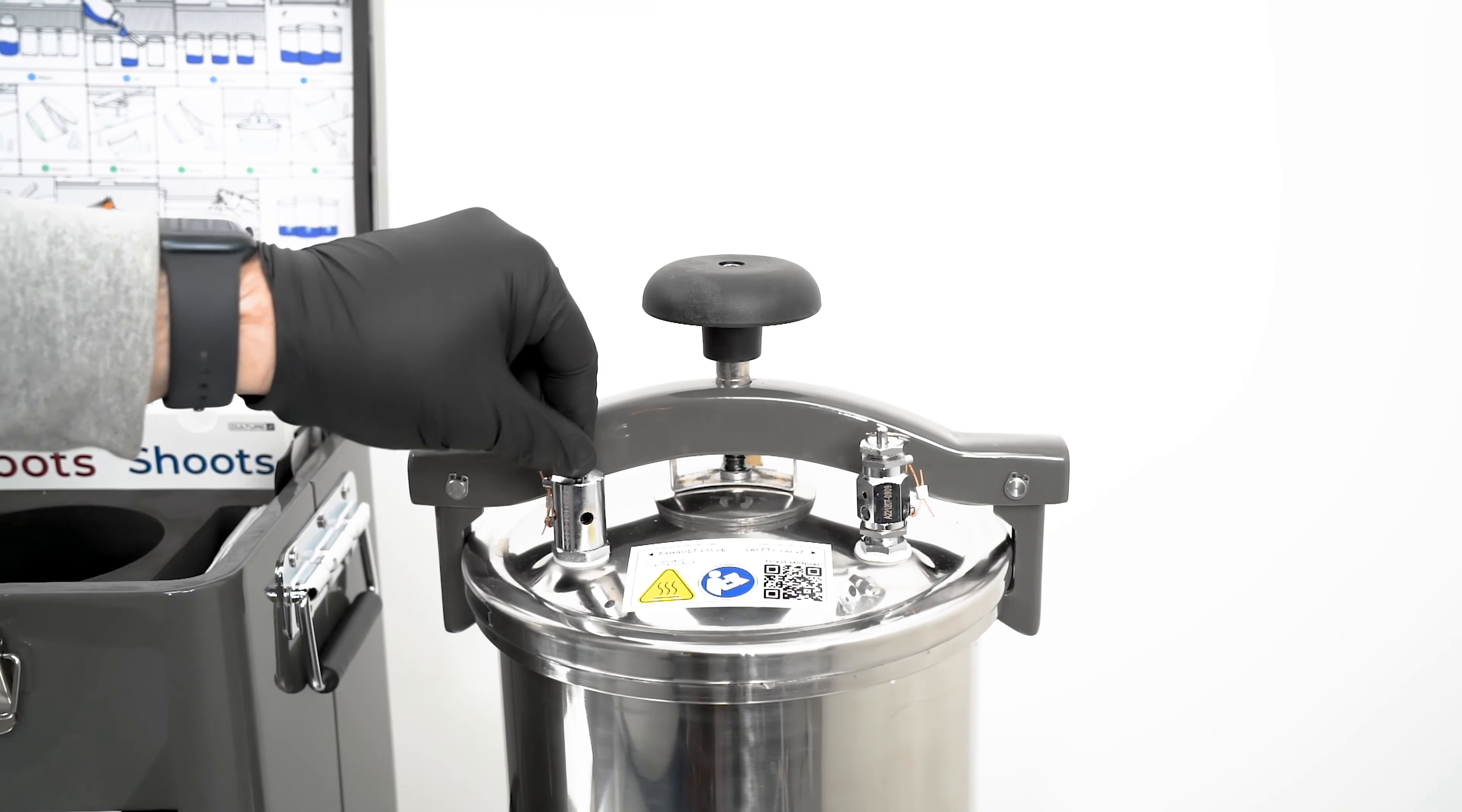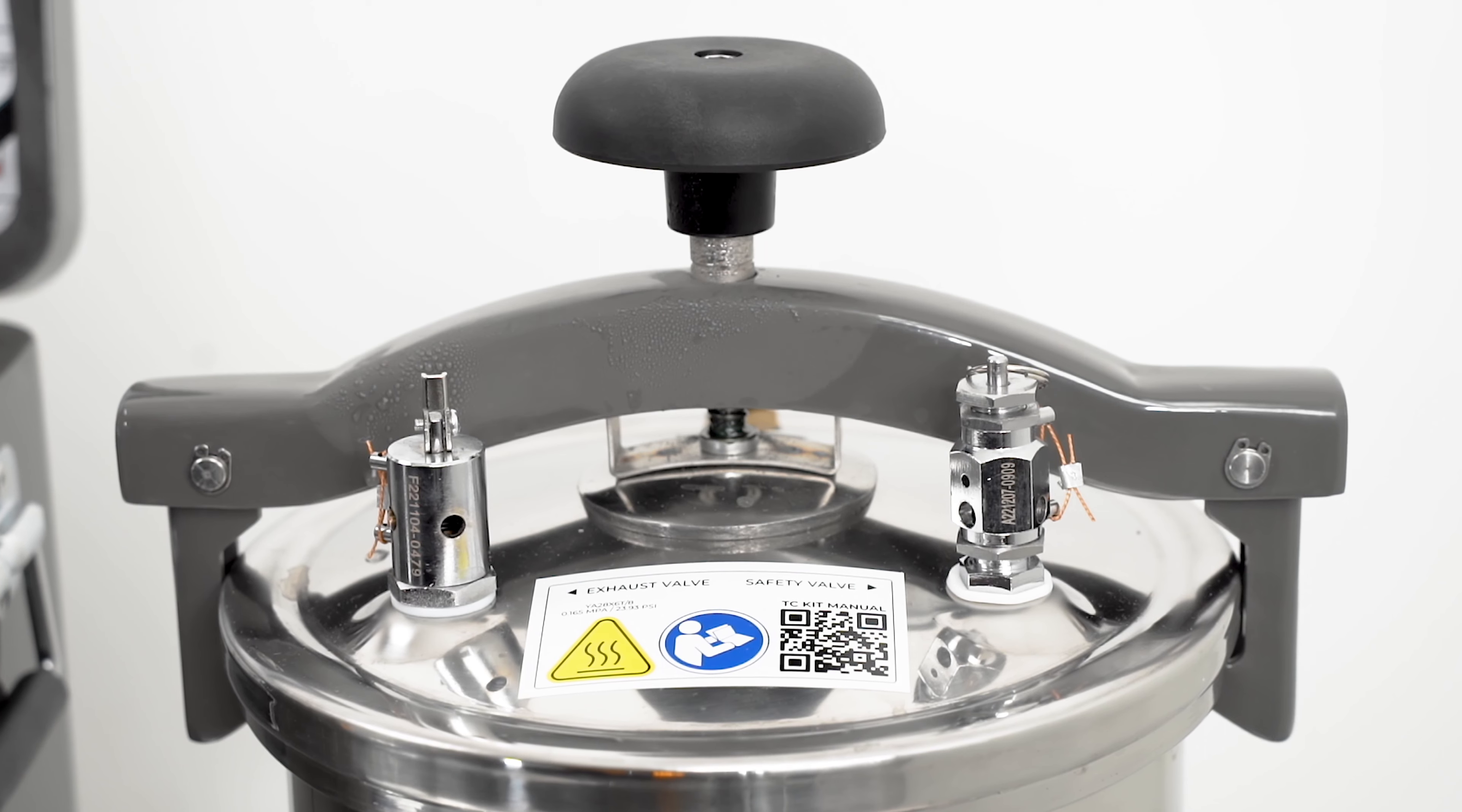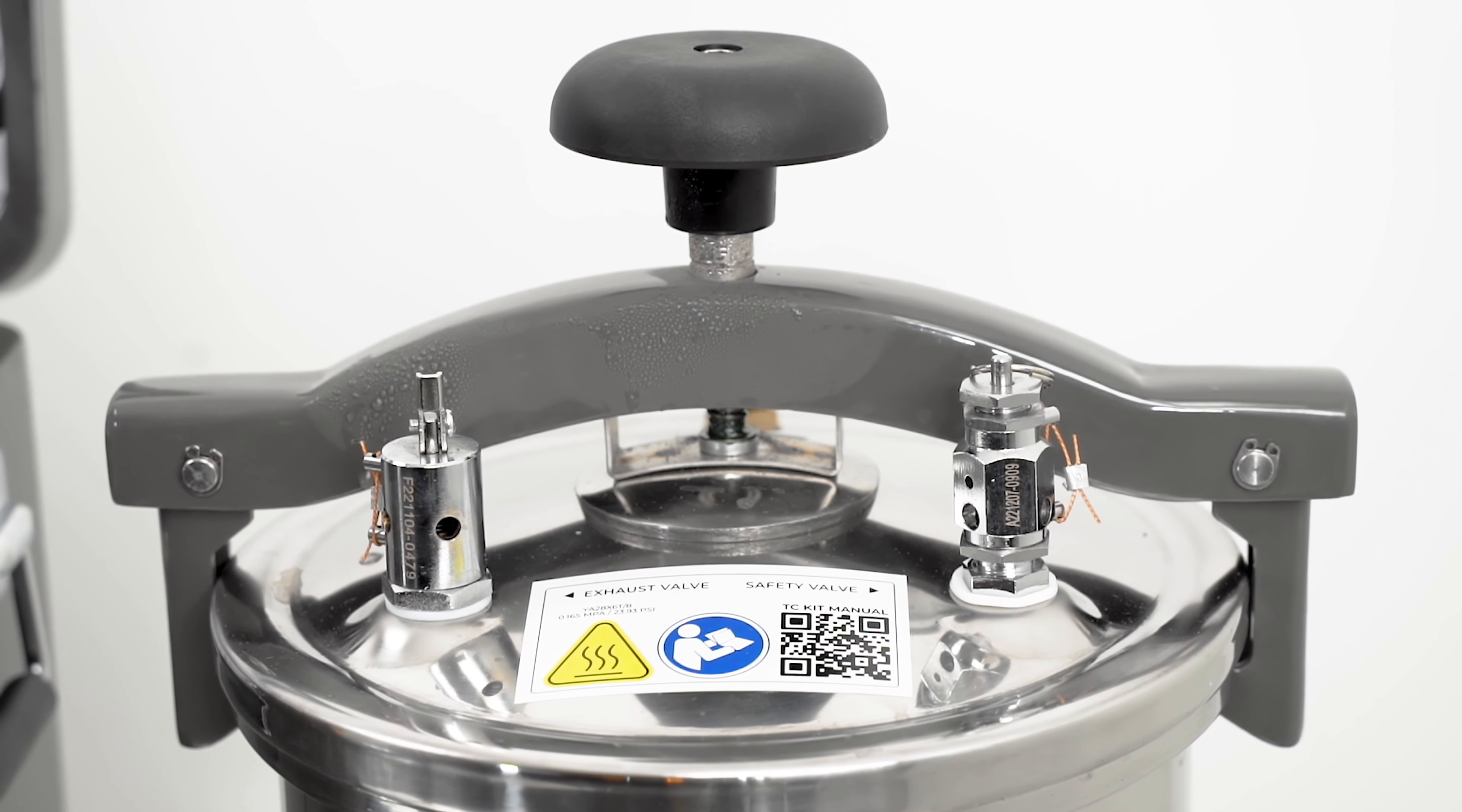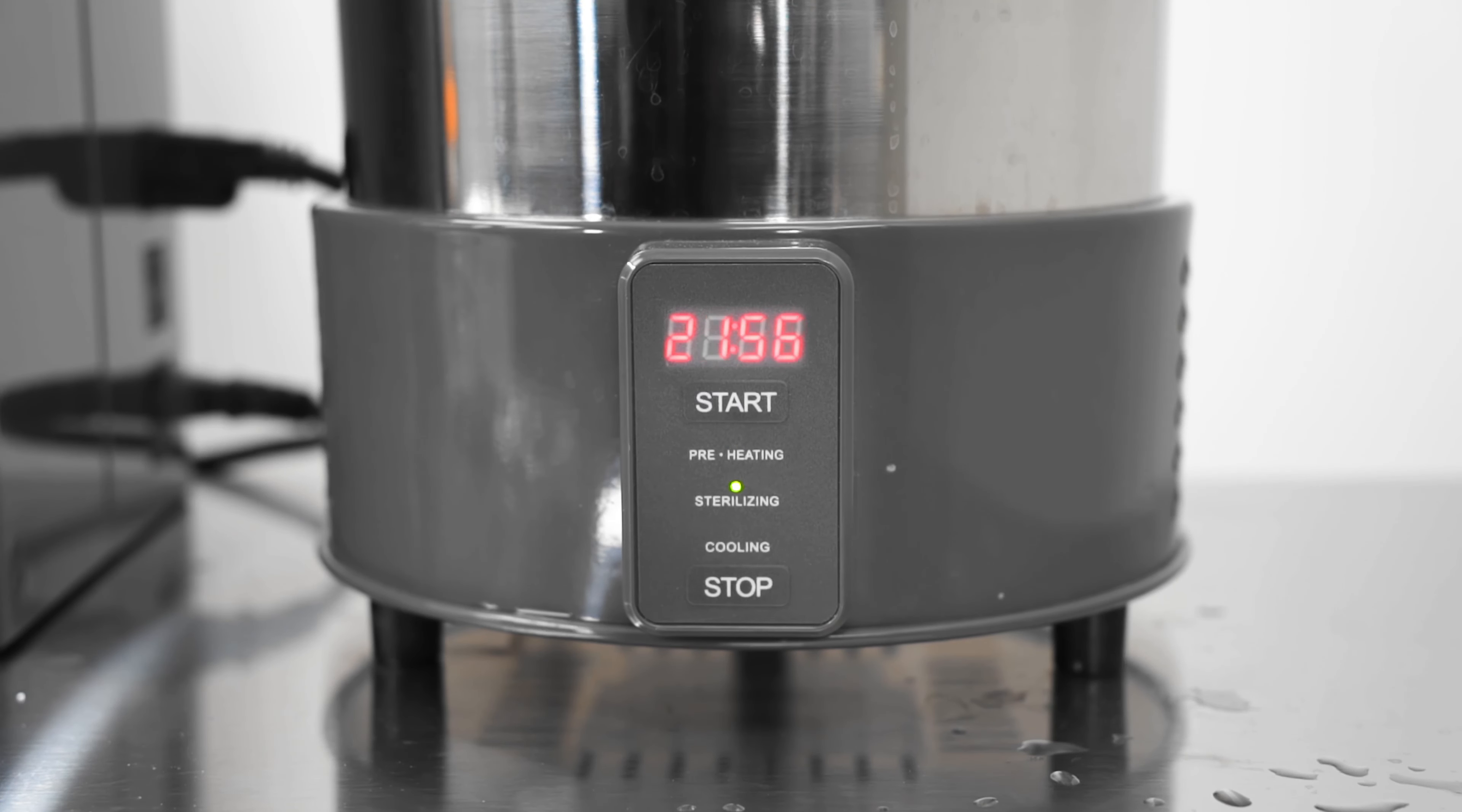Ensure the autoclave exhaust valve stays open after pushing start until the water begins to vaporize. This may take 8 to 10 minutes. When the vapor is seen coming from the exhaust valve, you can now close it. This allows for any contaminated air to escape the autoclave prior to being sealed for sterilization.